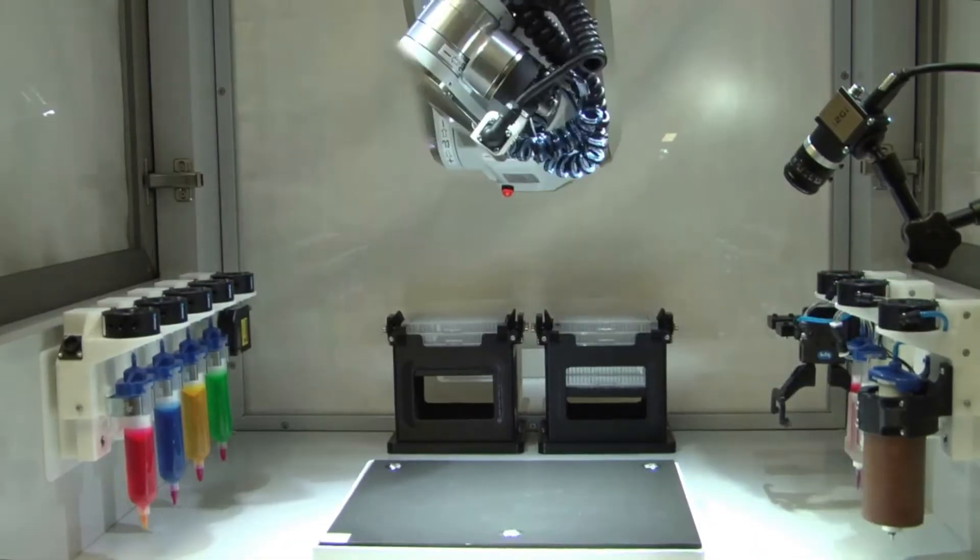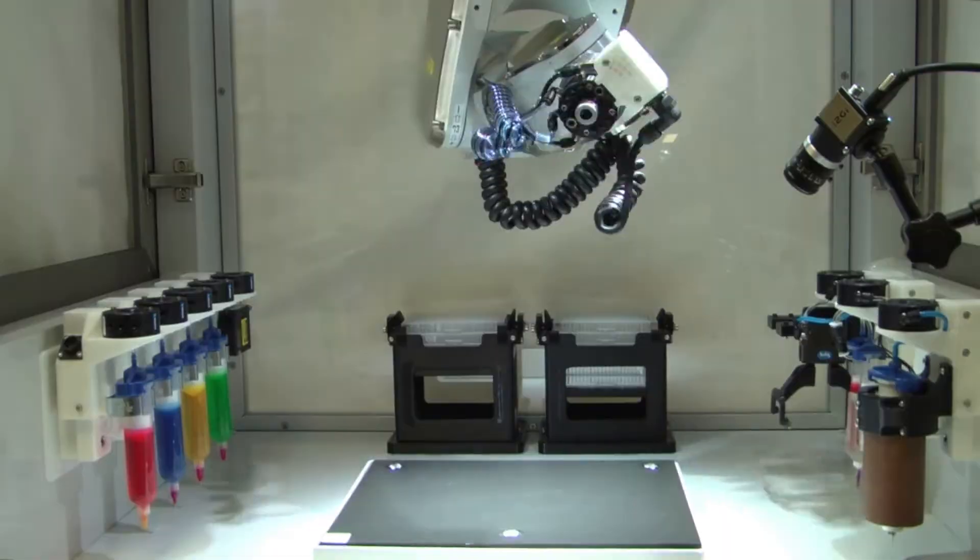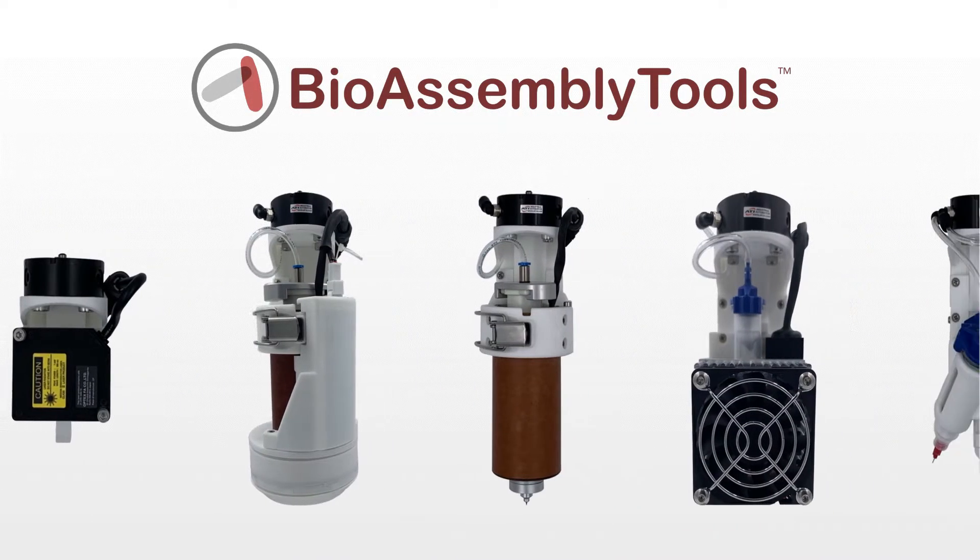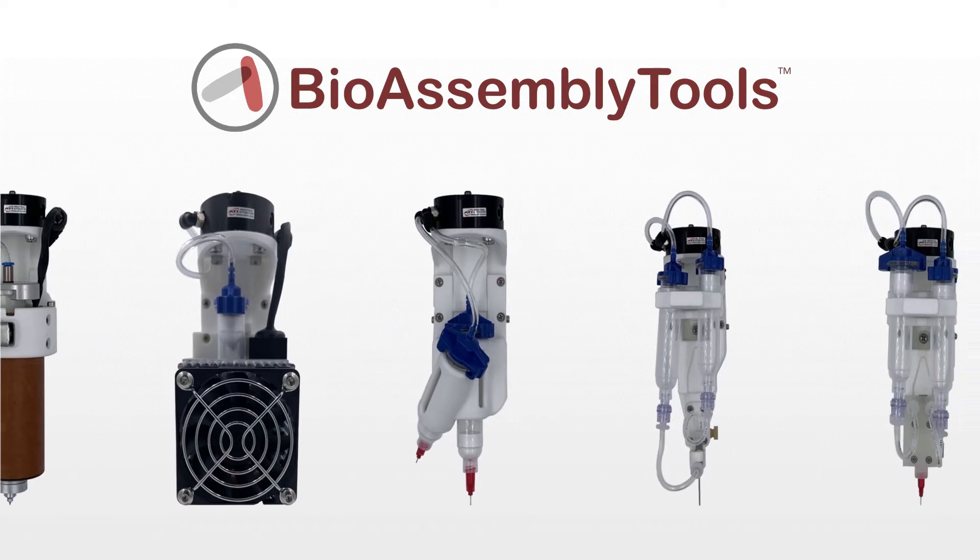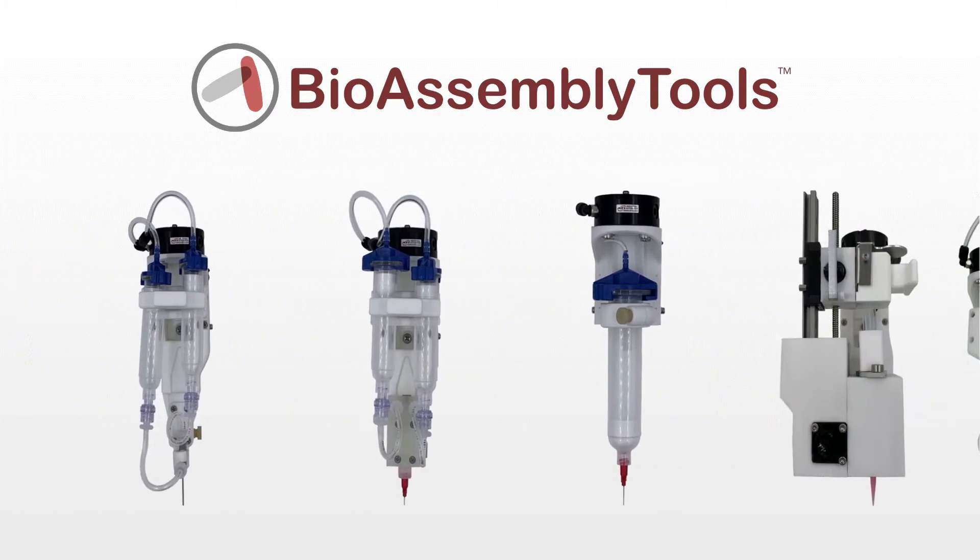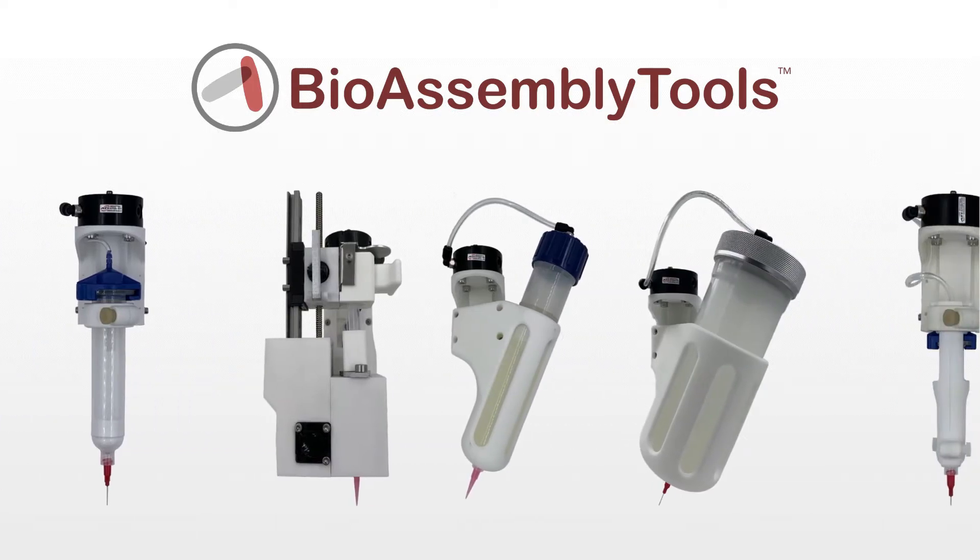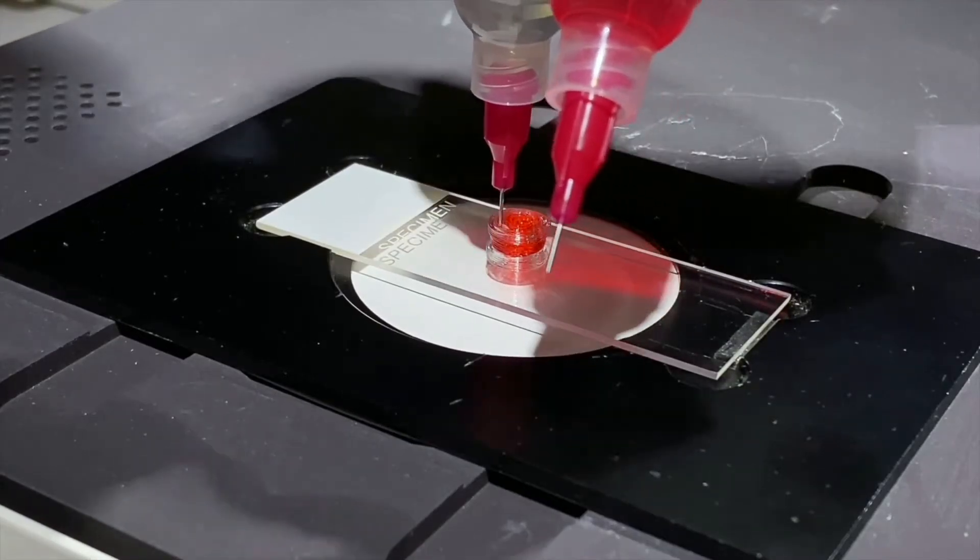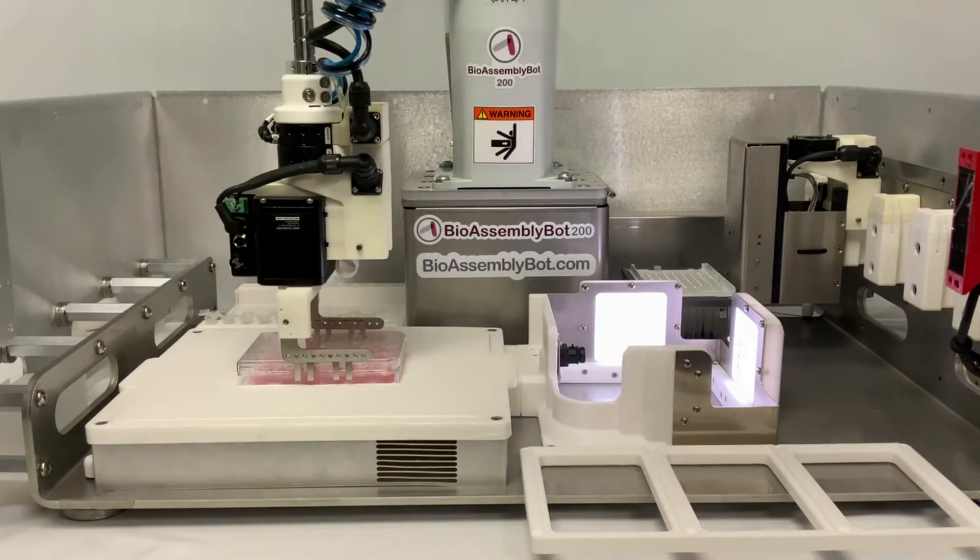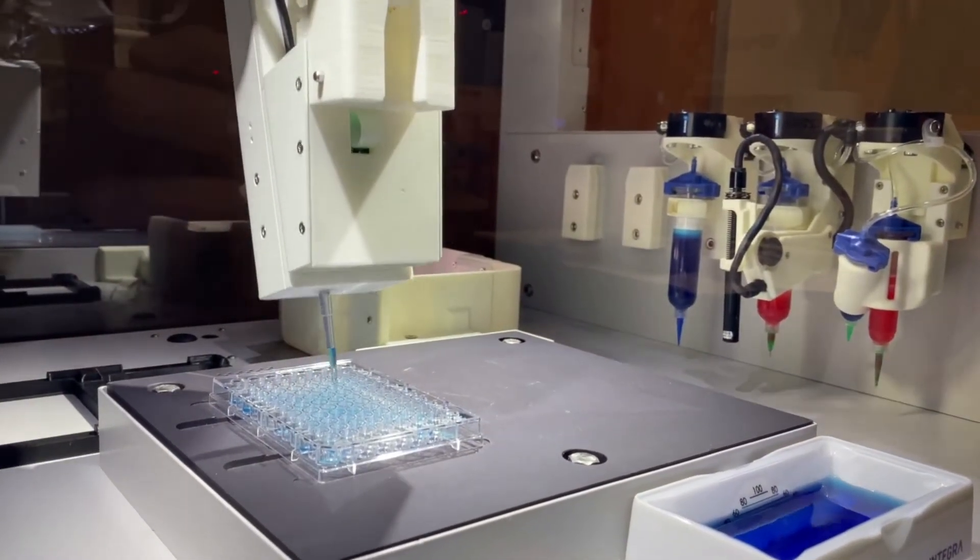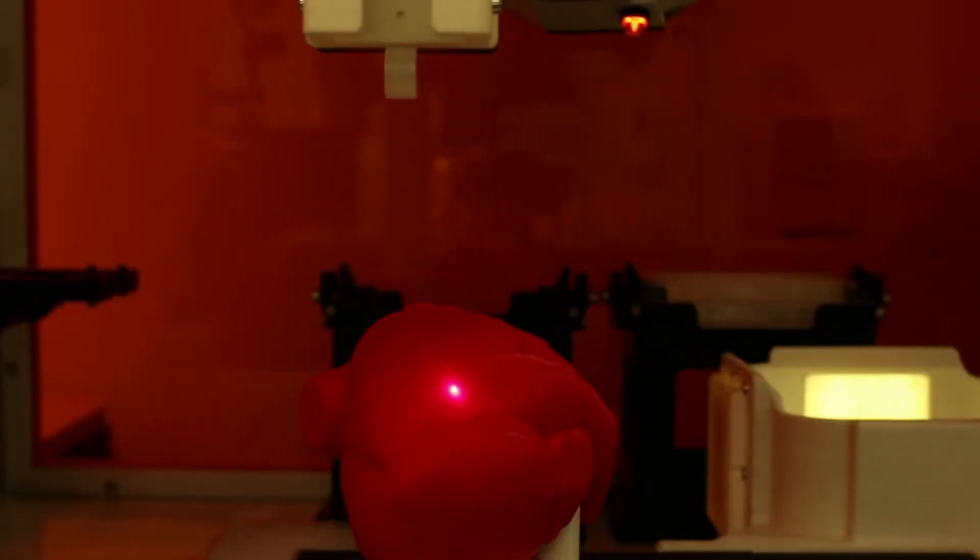One of the many features of BAB are her interchangeable hands. At the end of her wrist, there's a universal connector that joins with a growing library of bioassembly tools. Yes, a robotic hand for every task, including injecting cells, building 3D biology, moving material around, and pipetting at micro precision to name a few. BAB even offers our clients the ability to build their own bioassembly tools.